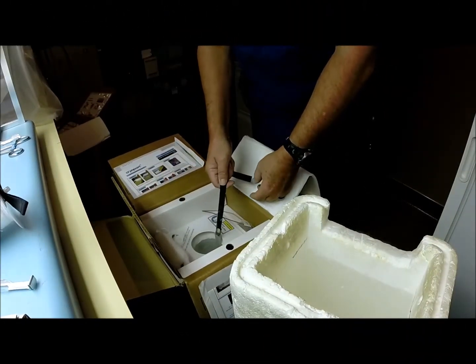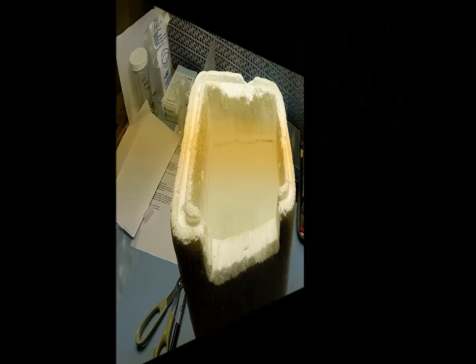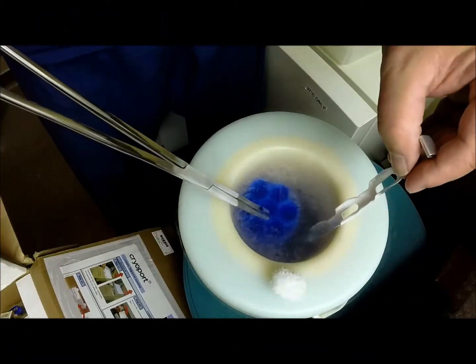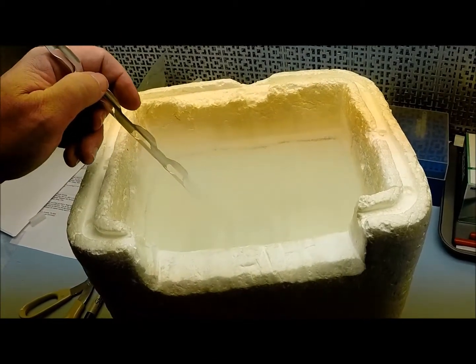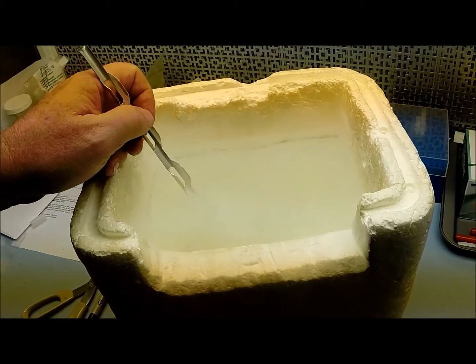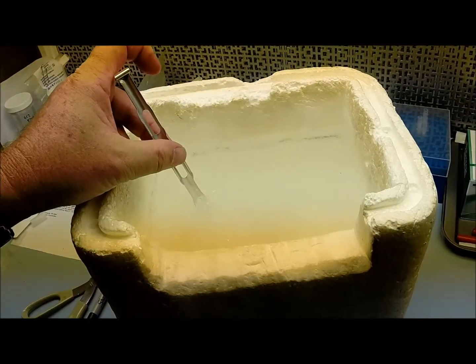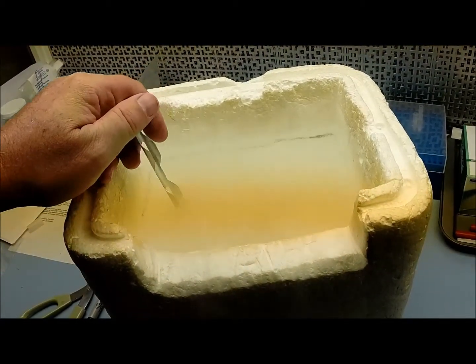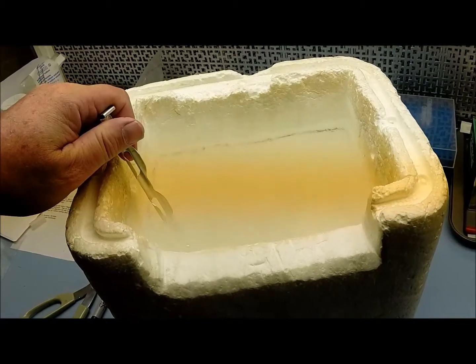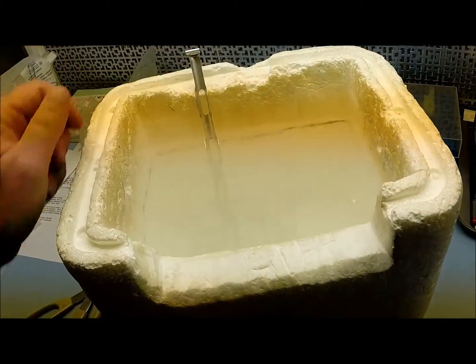Now you need to set up a transfer box to transfer the devices from the shipping goblets into your storage goblets. You will need a styrofoam box or a similar tall container. This box or container should: one, hold the shipping goblet; two, hold the storage goblets; and three, be tall enough and contain enough liquid nitrogen to be about half again as tall as the goblets. In most cases, you should have at least eight inches of liquid nitrogen. For most devices, this box must be about eight inches tall and be completely filled with liquid nitrogen. Never attempt transferring the devices through air.